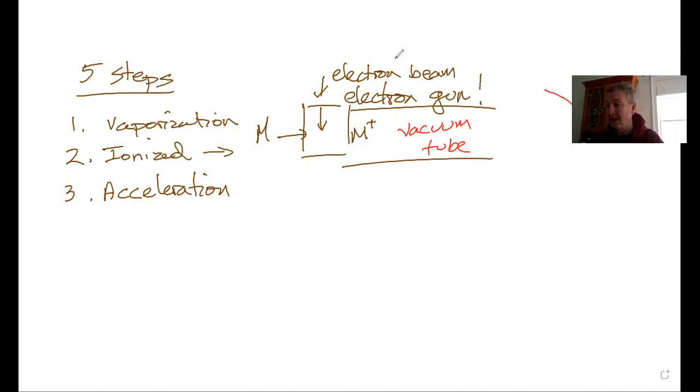What exists here is magnets. What happens there is that it encounters those magnets and it deflects.